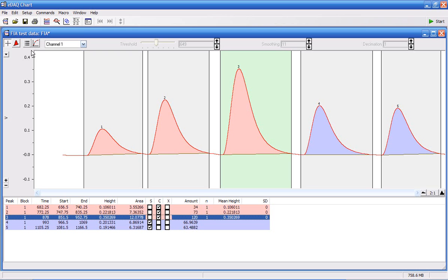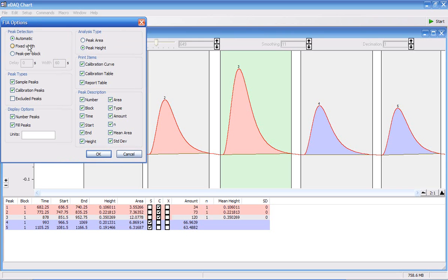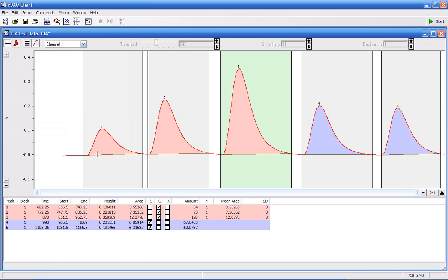You have options here in settings. At the moment, the analysis is being done by peak height. I can also analyze by peak area. It's slightly modified the concentrations of my two sample peaks.